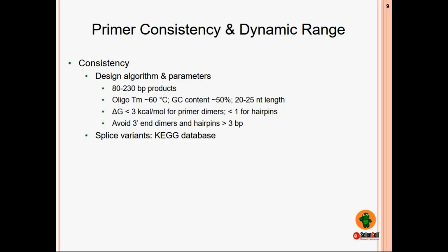This is important because all qPCR primers will be subject to the same operating conditions, and the whole key to qPCR relies on the amplification step being fairly predictable, i.e. a doubling each cycle. If you have a primer pair with an optimal annealing temp 8 degrees off from all of the other primers in your array, that particular gene will likely get amplified differently compared to all of the other ones, and you might not even realize it. Maybe it only gets 1.5 doublings per cycle instead of 2.